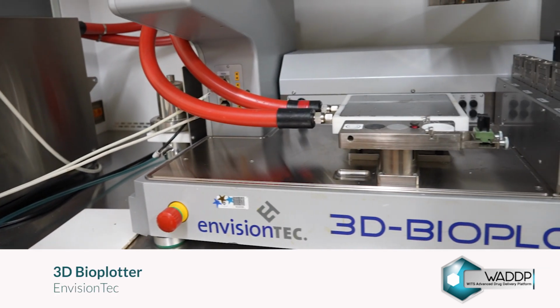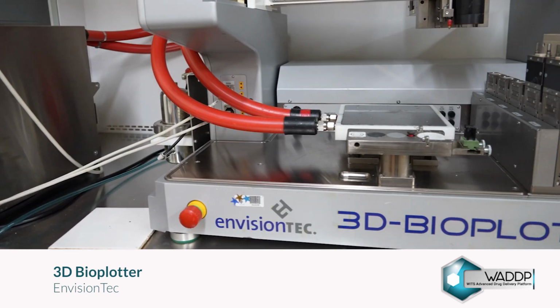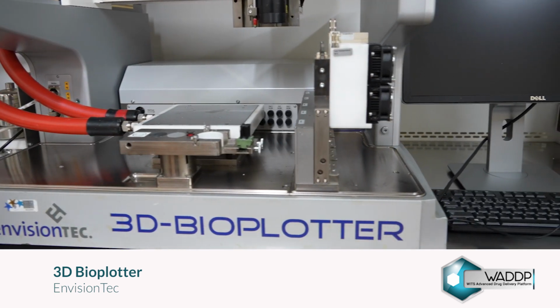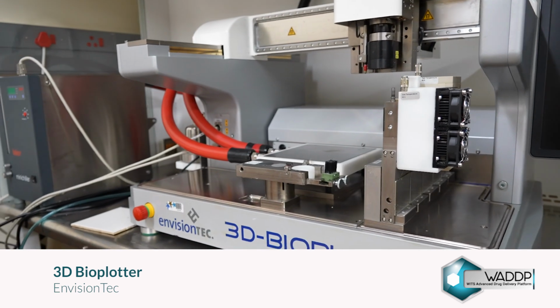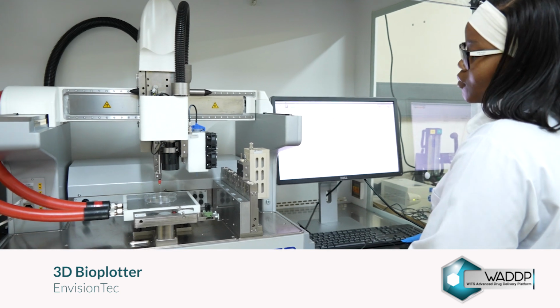The 3D bioplotter is used for biomedical and tissue engineering applications, like creating scaffolds for bone and soft tissue regeneration, printing organ models, and fabricating cartilage and heart valves.